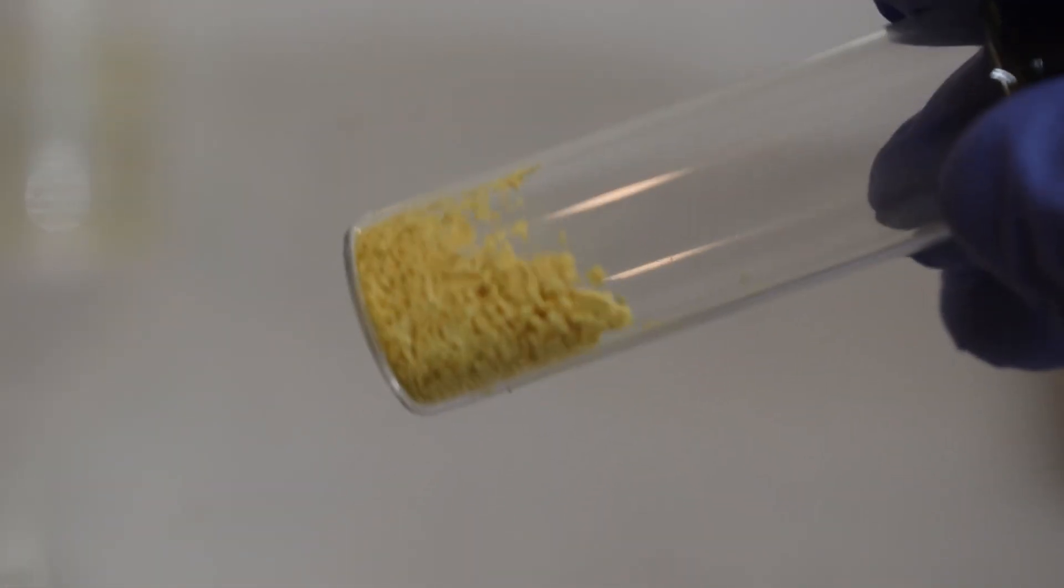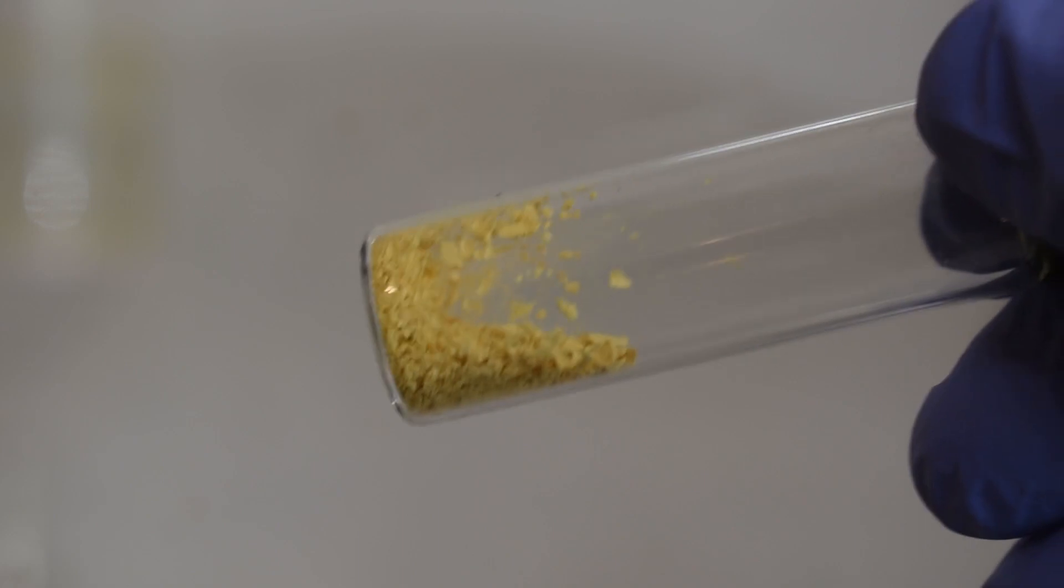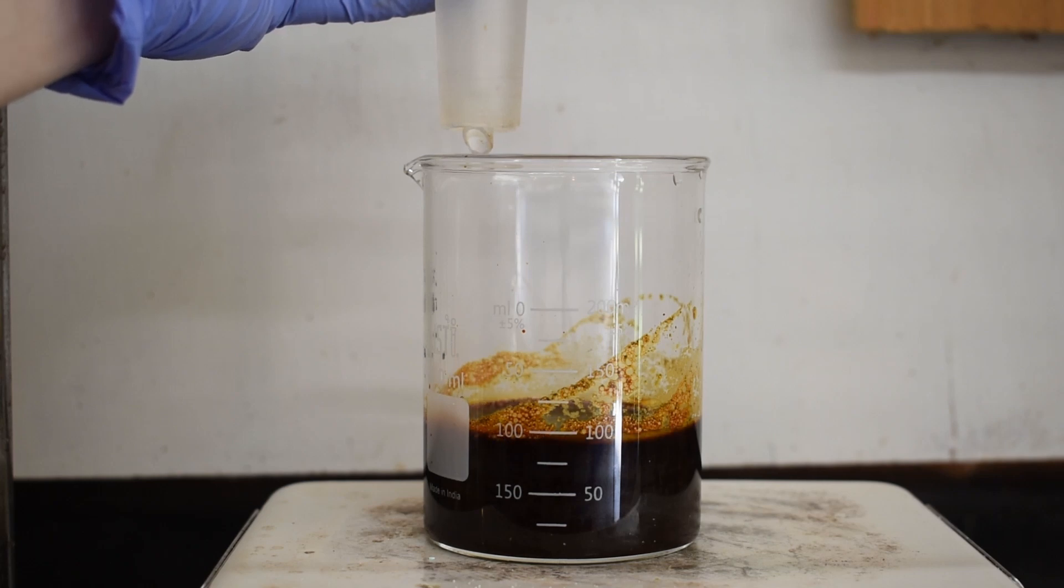In today's video I'll be making iodoform starting from potassium iodide. Iodoform is the iodine analog of chloroform and bromoform, however its properties are a bit different. Unlike the other two, it's a solid at room temperature and forms bright yellow crystals.